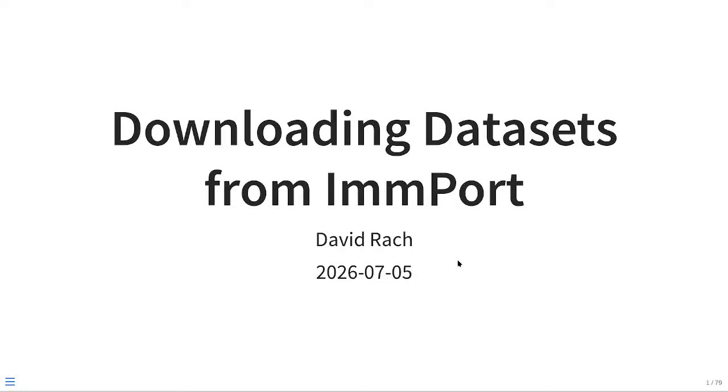So this recording is covering one of the extended bonus walkthroughs tied with week 12 spectral signatures. Basically, this one's not meant to supplant the week 12 material, but to complement it, going into additional depth on some of the aspects being covered, and more importantly, showing you how the different steps were done in the background, aimed at if you're trying to implement it on your own, without having to go as far into the detailed weeds about what's happening in each individual line of code.